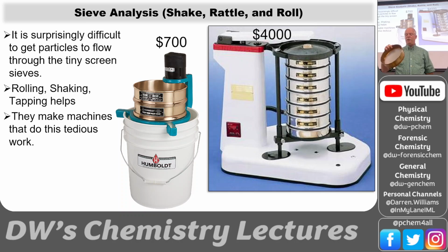Yeah, it says aperture. So the aperture, or the size of the hole in this mesh, is 75 microns, and this one is 500 microns. So I got two at the extremes so that you could see the difference between them. And I'll pass these around. You can see this one just looks like a film, but it's actually a wire mesh, a steel wire mesh.